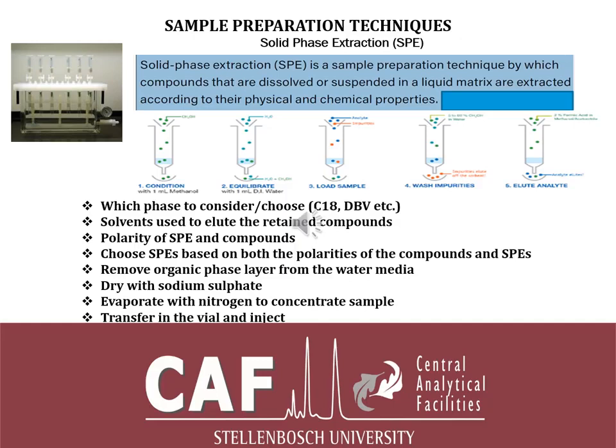Also now, like you did with liquid extraction, if you had a water phase in your organic phase, if you had some water, you can dry them with sodium sulfate, and as mentioned earlier, you can evaporate with nitrogen to concentrate your sample either to completion or to a certain volume. You can transfer it to a vial and inject, or from there on you can do derivatization, offline derivatization if you're not doing online derivatization. So there's a lot of opportunity for that.